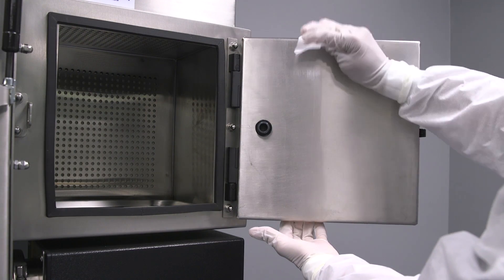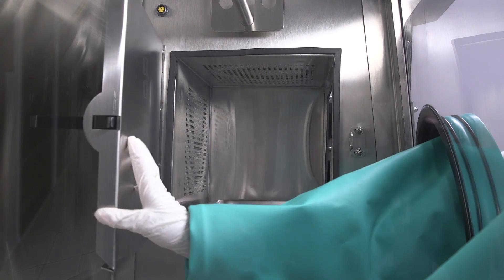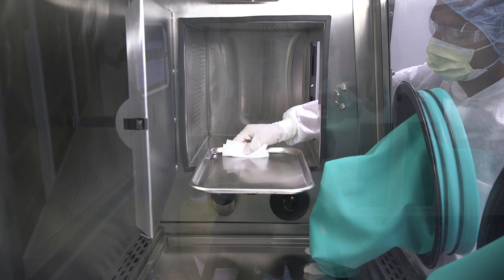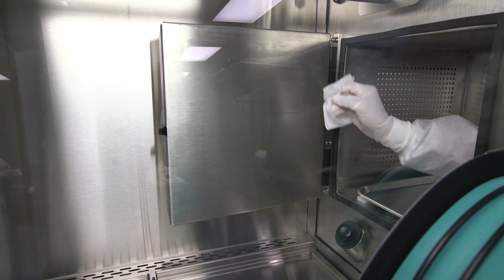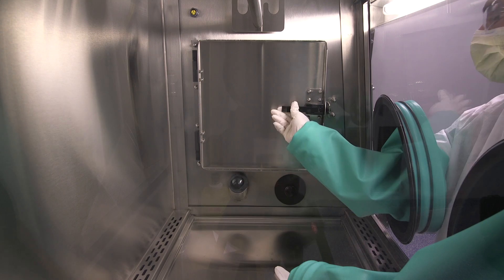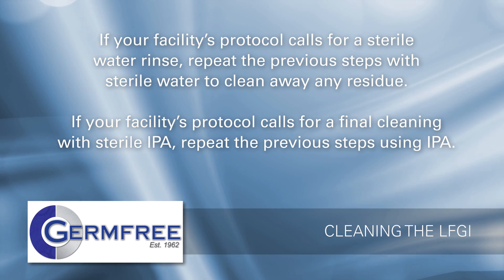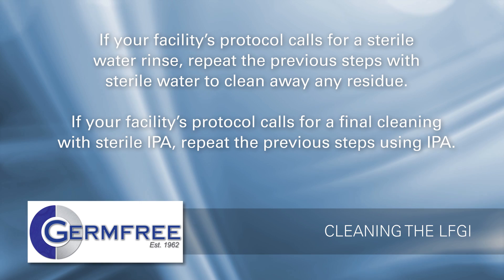Open the airlock door that leads to the work area and slide the tray out into the work area. Clean the bottom filter of the airlock that is normally covered by the tray, then the tray itself. Once you've finished cleaning the bottom of the airlock, slide the tray back into the airlock. Clean the inner airlock door. Close and latch the inner airlock door once you've finished. If your facility's protocol calls for a sterile water rinse, repeat the previous steps with sterile water to clean away any residue. If your facility's protocol calls for a final cleaning with sterile isopropyl alcohol, repeat steps one through six using IPA.